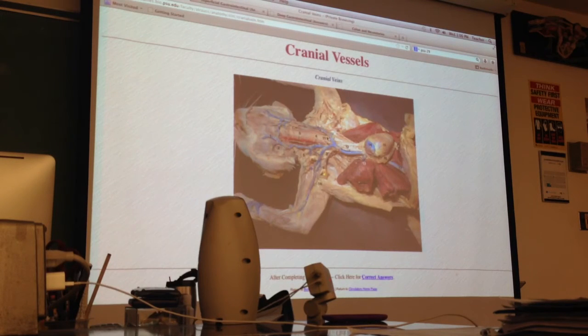And then we have lungs. Obviously, the lungs are going to be on either side of the heart. You don't need to identify the individual lobes of the lungs. Just know that they're in the thoracic cavity, basically the only other organ in the thoracic cavity other than the heart. Do keep in mind, though, if we pin the lungs, depending on what the question's asking for, we could be asking you to identify the lungs, or we could be asking you to identify the visceral pleura. So if we pin this and we're asking for the membrane or the layer, we're asking for the visceral pleura. If we pin this and we're asking you for the organ or the structure, we're asking for the lungs.